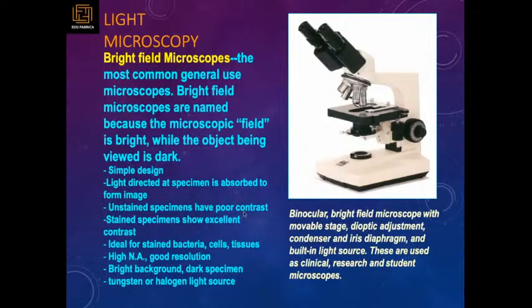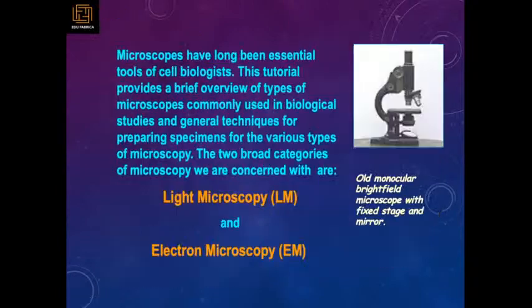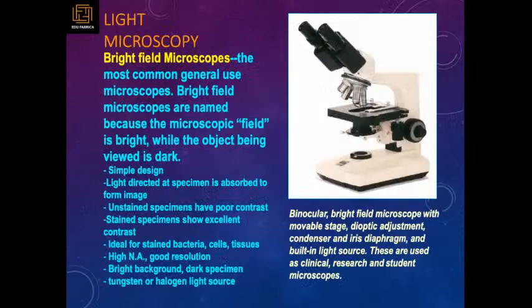So this is the binocular bright field microscope with a movable stage. The stage can be moved, and it has an iris diaphragm and a built-in light source. So we use them for clinical research as well as student microscopes in day-to-day life.